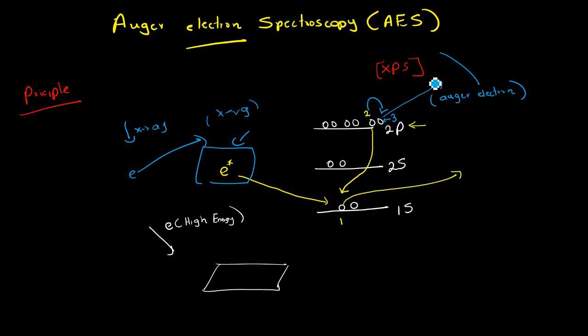But if you remember about XPS, I will put the link here again, because it is very important. In XPS, the X-ray source is the one that pops out the electron, so the energy of the electron is directly proportional to your energy source. That's a big thing.